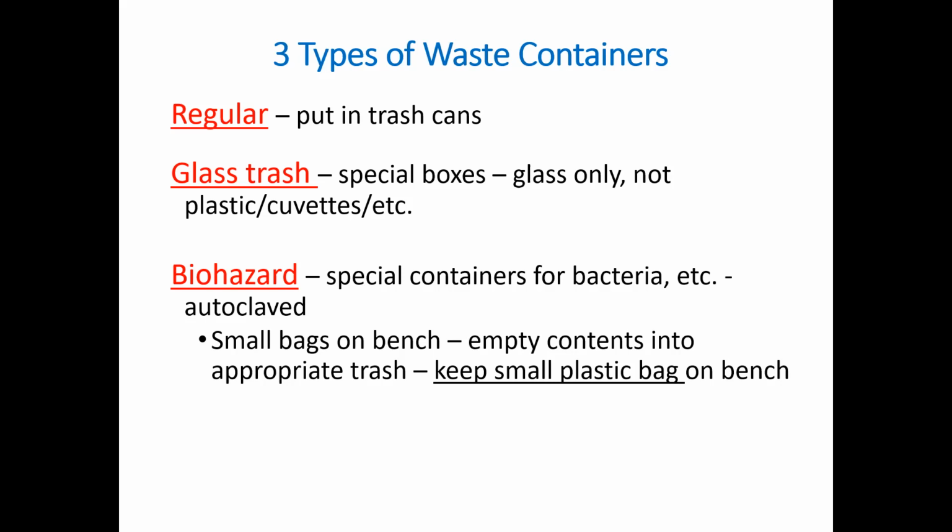There are also biohazard bags. We'll set out a special container for biohazard DNA and bacteria that need to be autoclaved to be killed. This includes tubes that you've used, paper towels, etc. On each bench, there's a small bag and an orange holder.